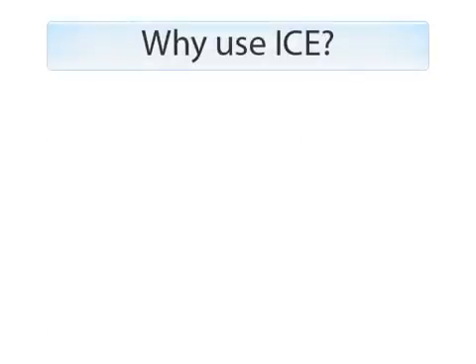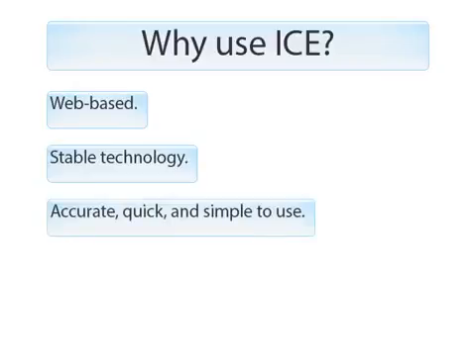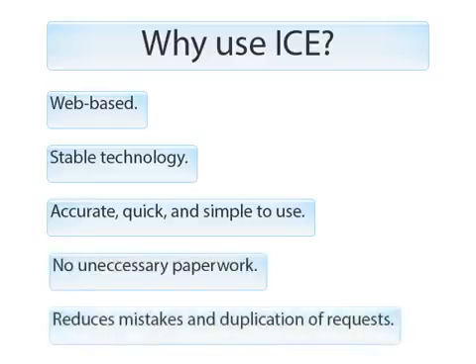Let's look at some of the benefits of using ICE. ICE is purely web-based and built on stable system-to-system technology. ICE is designed to optimize the task of ordering pathology tests, yet is quick and simple to use. ICE allows for accurate ordering and does away with most of that paper, thereby reducing the risk of mistakes and the possible duplication of requests.